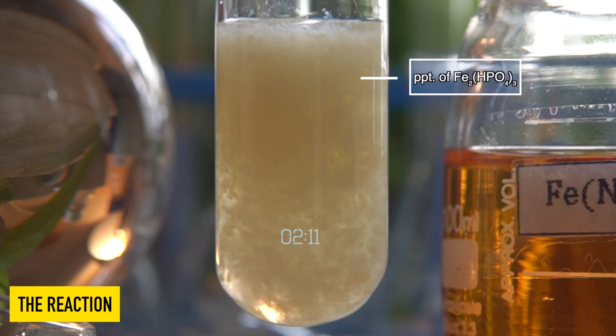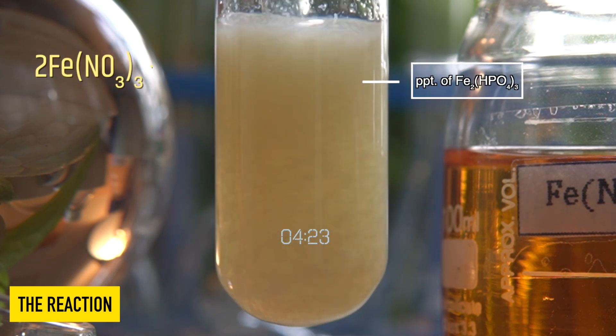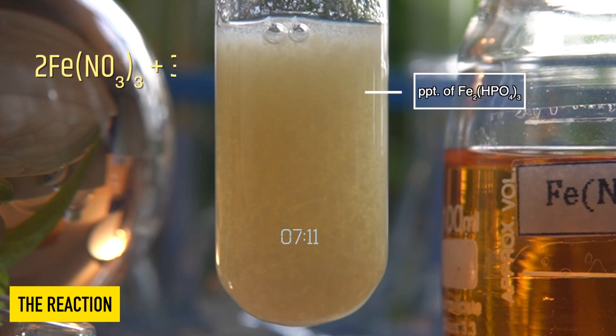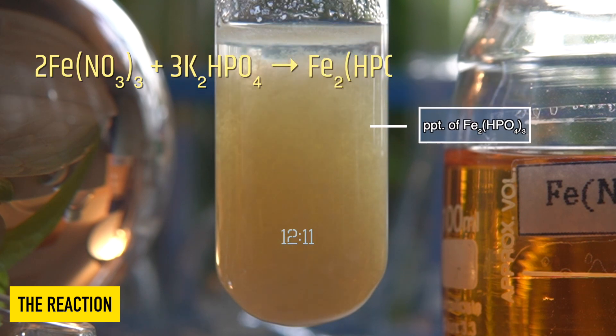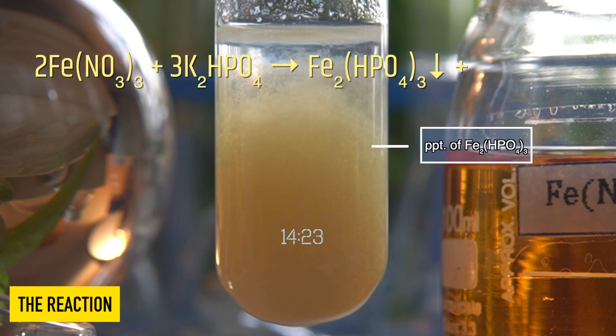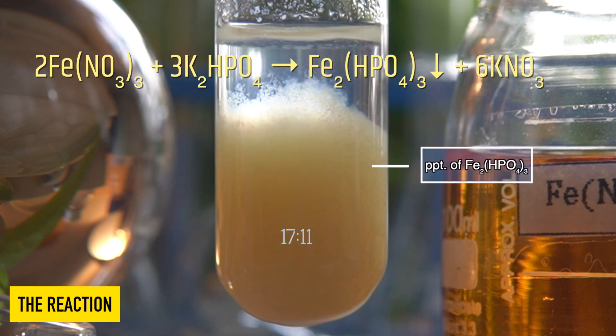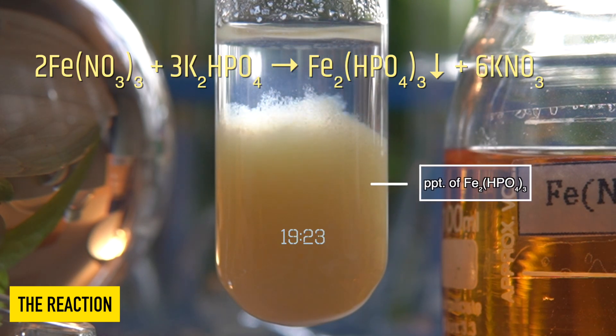In this reaction, iron three nitrate reacts with potassium hydrogen phosphate, producing brown insoluble precipitate of iron three phosphate along with potassium nitrate.